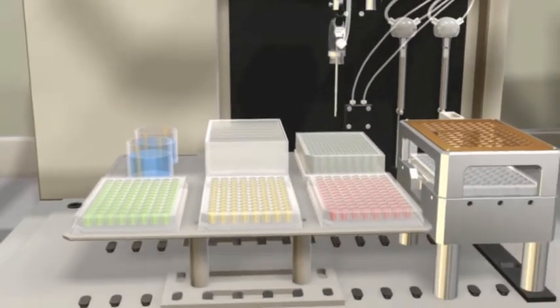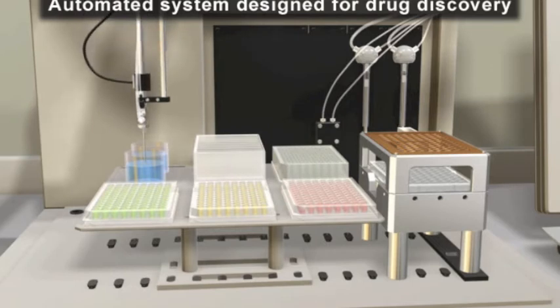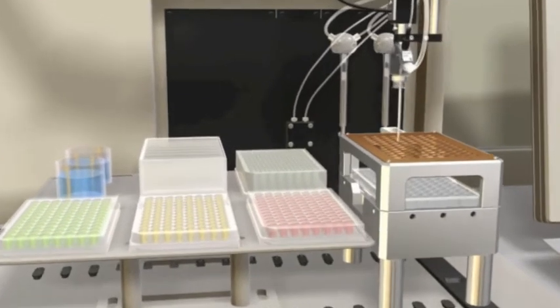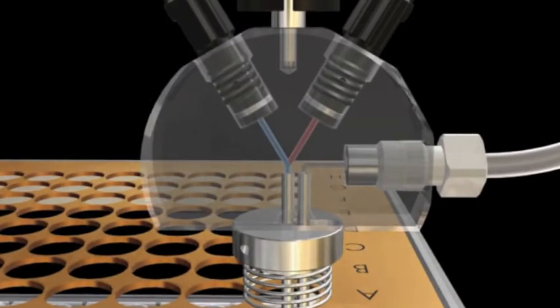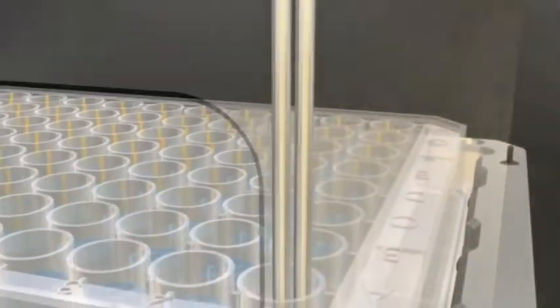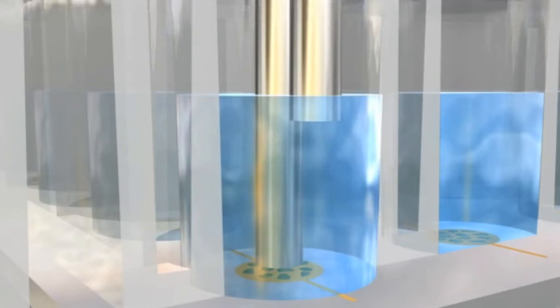When the sensor plate is mounted and the necessary assay reagents are prepared, the surfer workstation will completely process a 96-well sensor plate in a fully automated manner. Liquid handling is performed by the specially designed IonJet dispensing unit. Connected with two diluters and a membrane pump, the IonJet enables the generation of stacked solutions. A stream of stacked solutions is then dispensed into the sensor well, causing an extremely fast solution exchange over the sensor surface within a few milliseconds. The achieved synchronized activation of a multitude of transporter molecules provides unparalleled sensitivity of the surfer system.